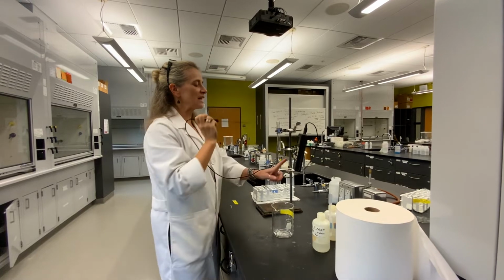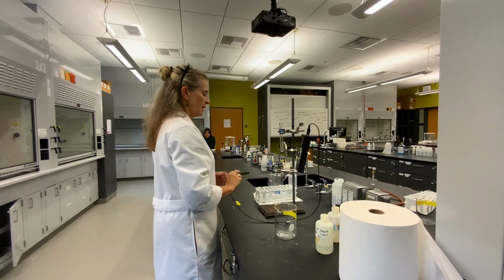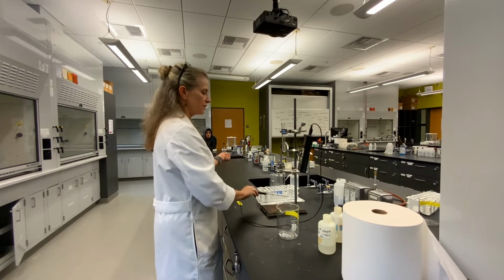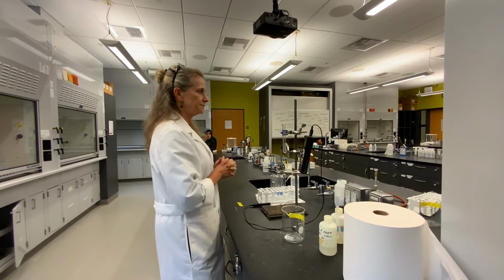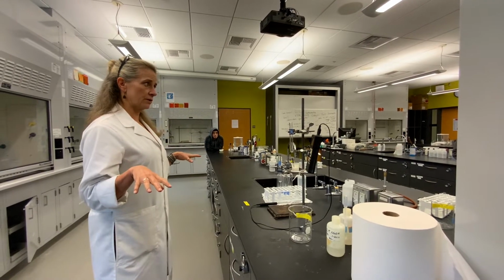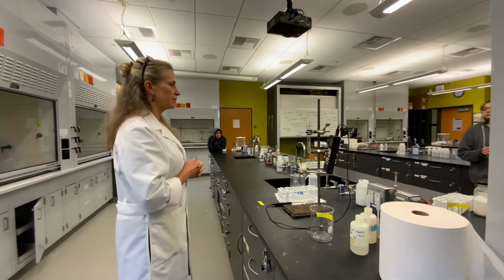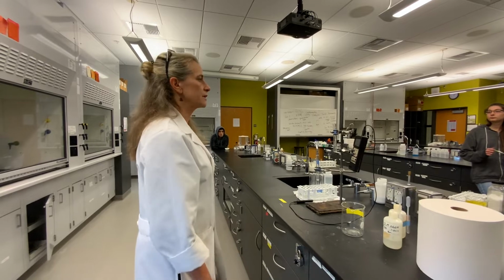Make sure you're on Celsius, okay? And then turn that off when you're done so you don't waste battery. Got it? It's nice of you to take this and rinse it off a little bit when you're done, but that's good. Waste goes in here. Got it? Okay. You do not have to do these 7 reactions in any order. And you guys are so small, it won't matter, but we don't want you to get all bogged up. So you guys probably can do what you want because it's a small enough class.